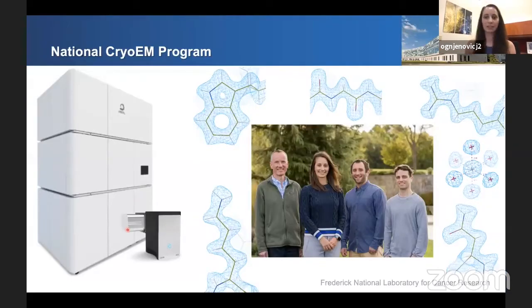One of our missions is to investigate novel and less explored emerging cryo technologies, and one such example includes our work on exploring cold FEG technology available on JEOL's cryo microscope. We want to compare how it compares to the standard Schottky FEG for high resolution cryo data collection.